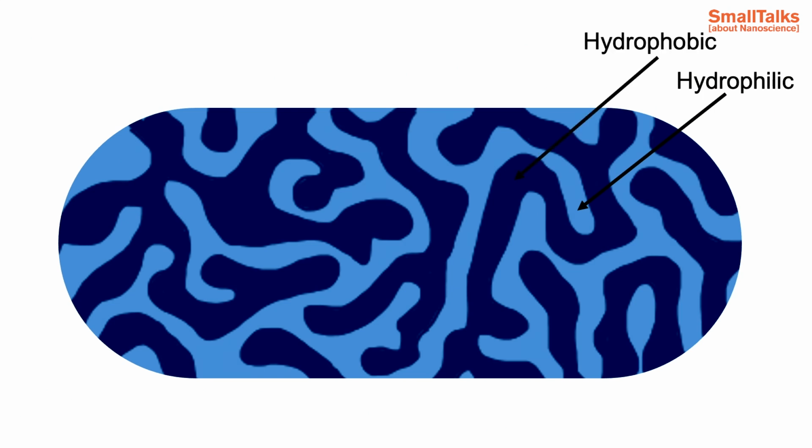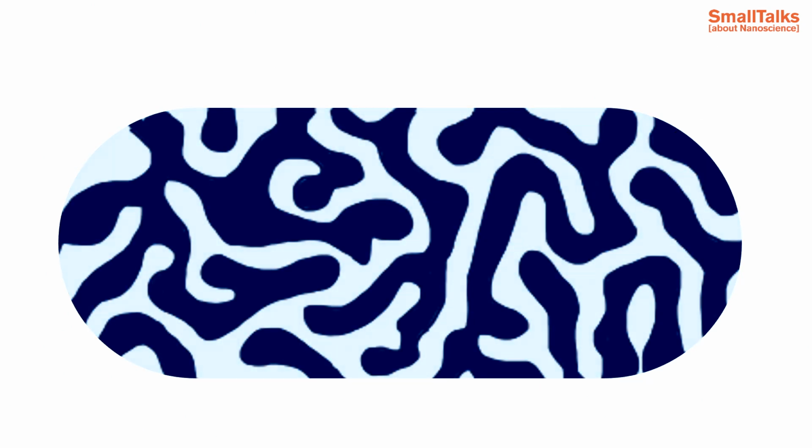This means that when the tablet is exposed to water, only the hydrophilic phase will dissolve, and the phase-separated morphology will provide a geometrical effect on the dissolution characteristics. This means that it will affect how the drug diffuses out from the material, and to understand the drug release mechanism, we therefore want to get a 3D image of the phase-separated morphology created by the two polymers.